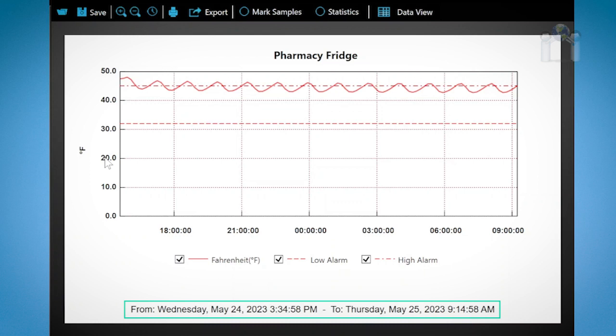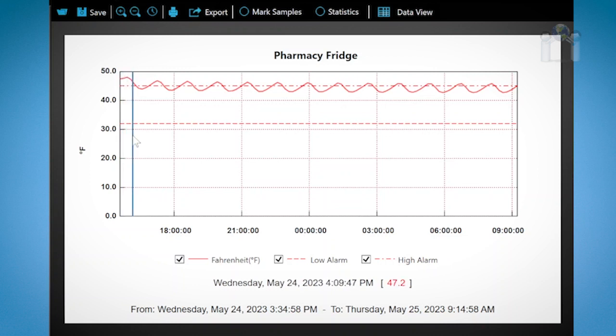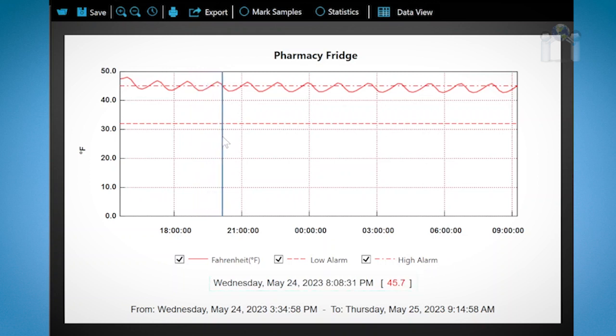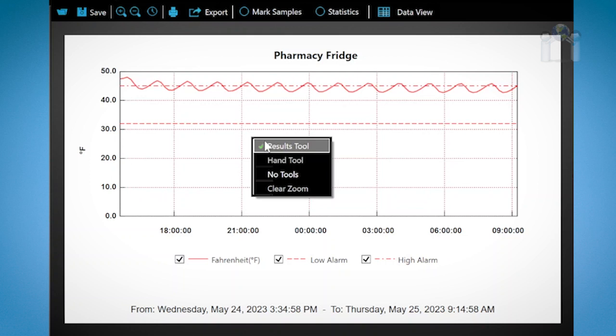Using your mouse you can scroll over the graph. If you look at the bottom of the window you can view the details of the reading at that particular time and date. If you don't wish to see this data you can right click on the mouse and select no tools. Clicking on result tools will restore the view.